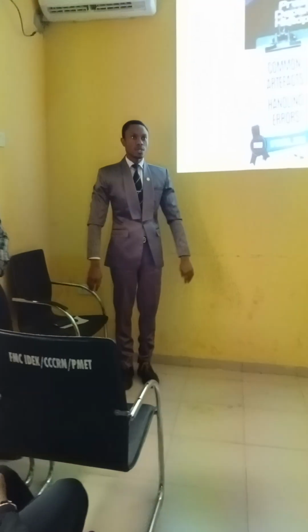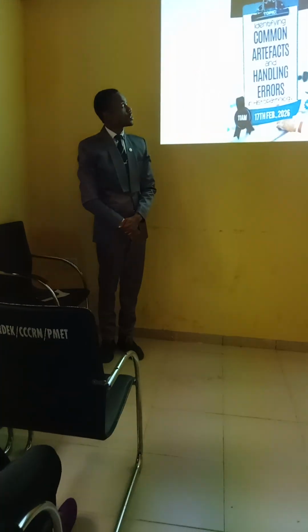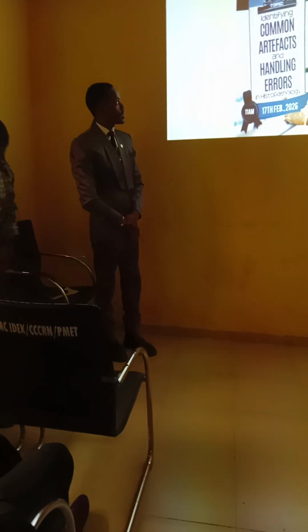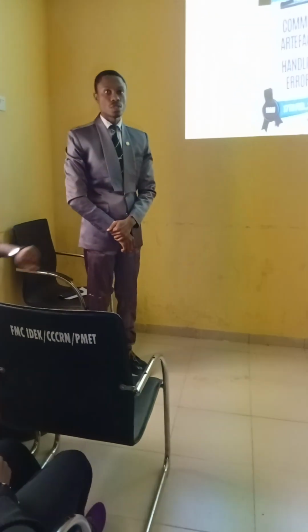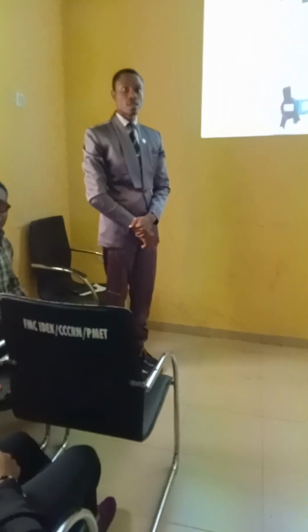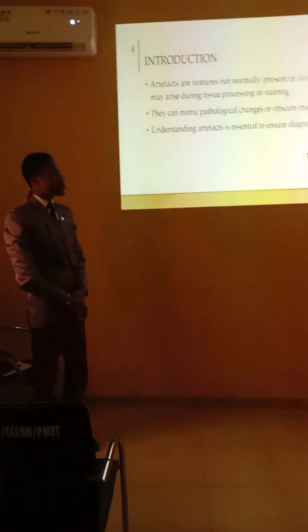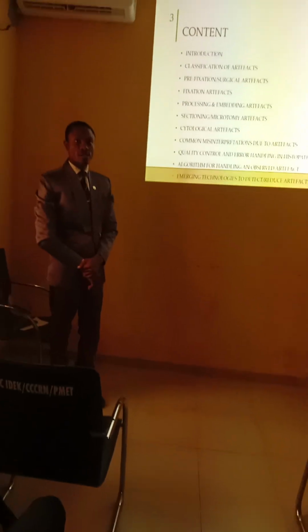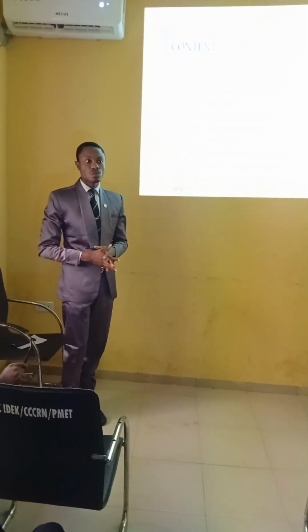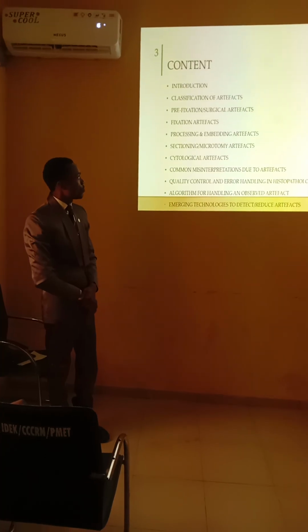Out of all the things I've been taught during my internship here at histopathology, I'll be presenting on the topic: identifying common artifacts and handling errors in histopathology. The next slide. In this seminar presentation, I will give the introduction and talk about some of the different artifacts and how to handle these errors in processing tissues, and then the conclusion.